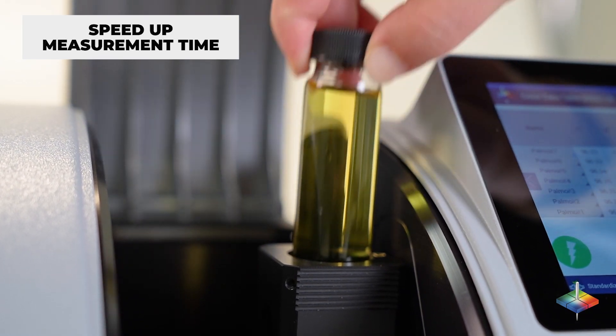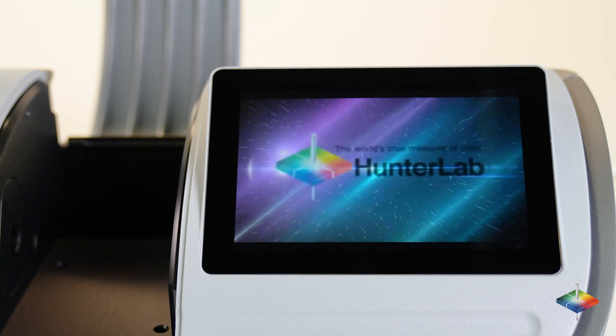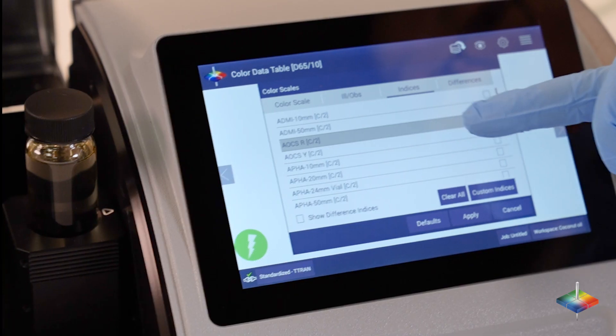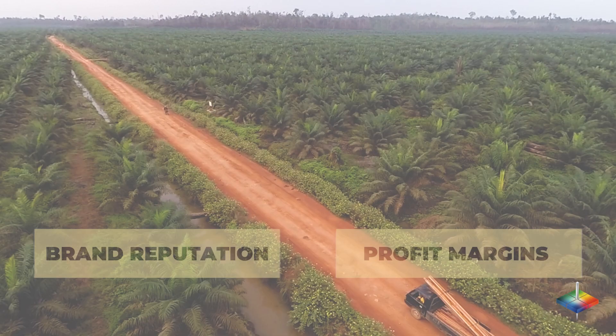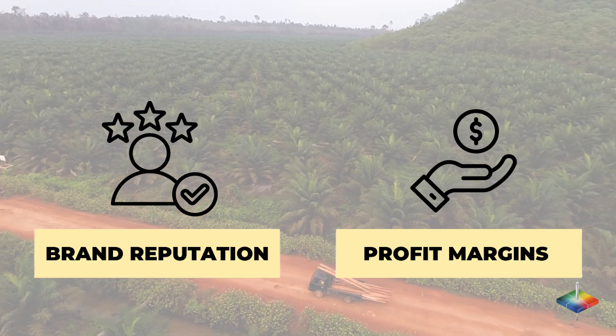Speed up your measurement process time while minimizing product waste and cleanup time. Hunter Lab makes your quality assurance process simple with all the pre-equipped color scales and indexes you need, an easy-to-use modern interface, and the latest data communication features. Rest assured your brand reputation and profit margins will always be in check.